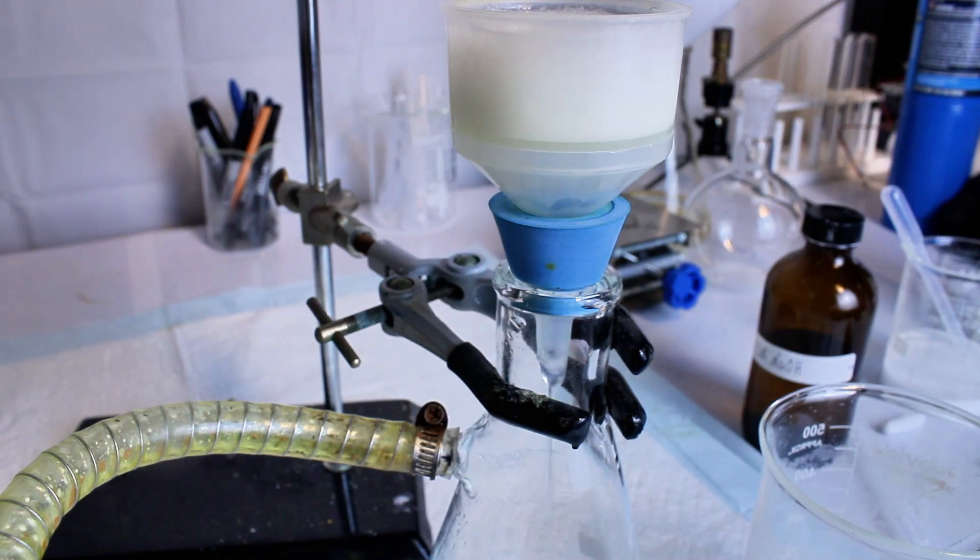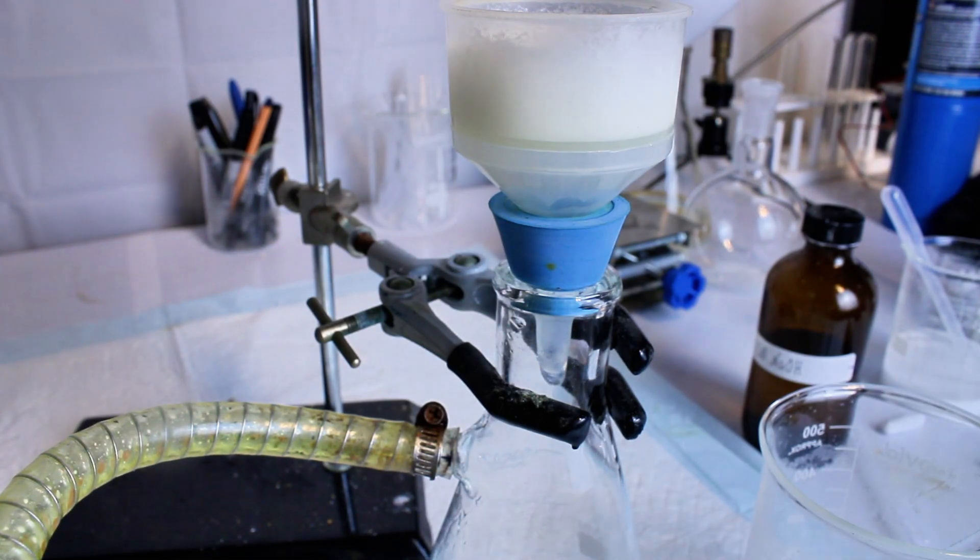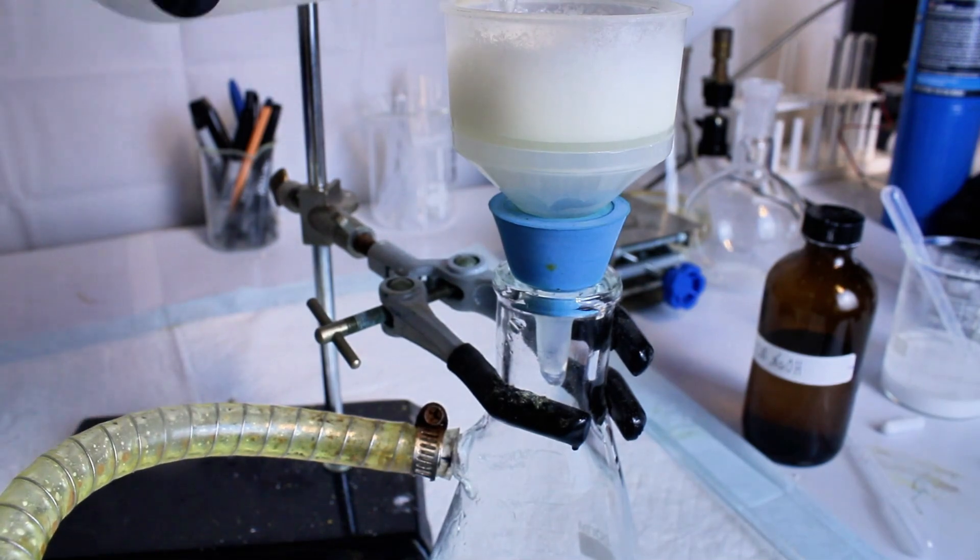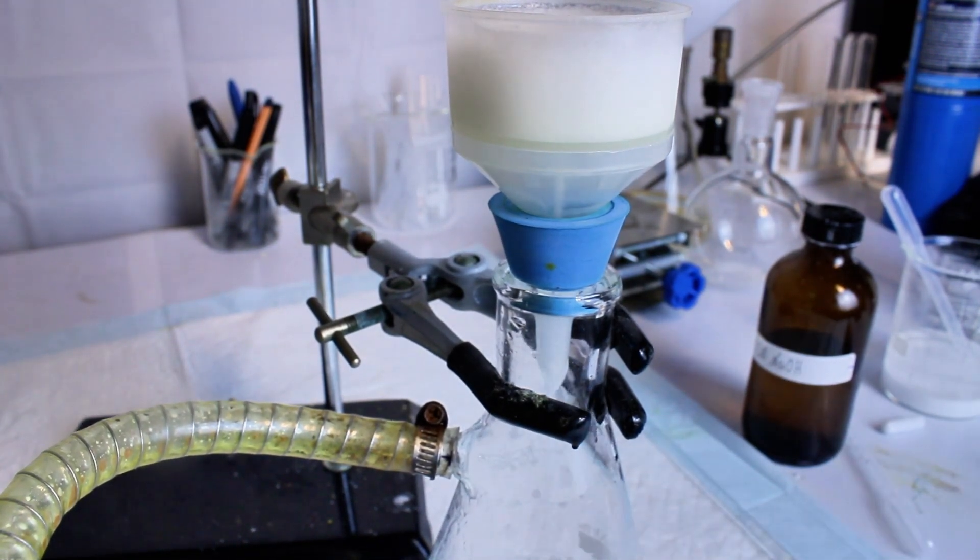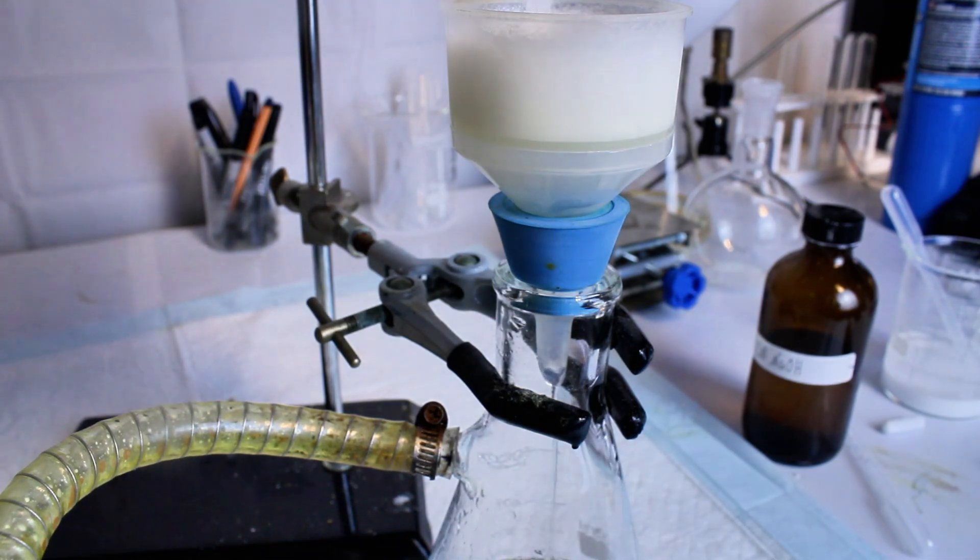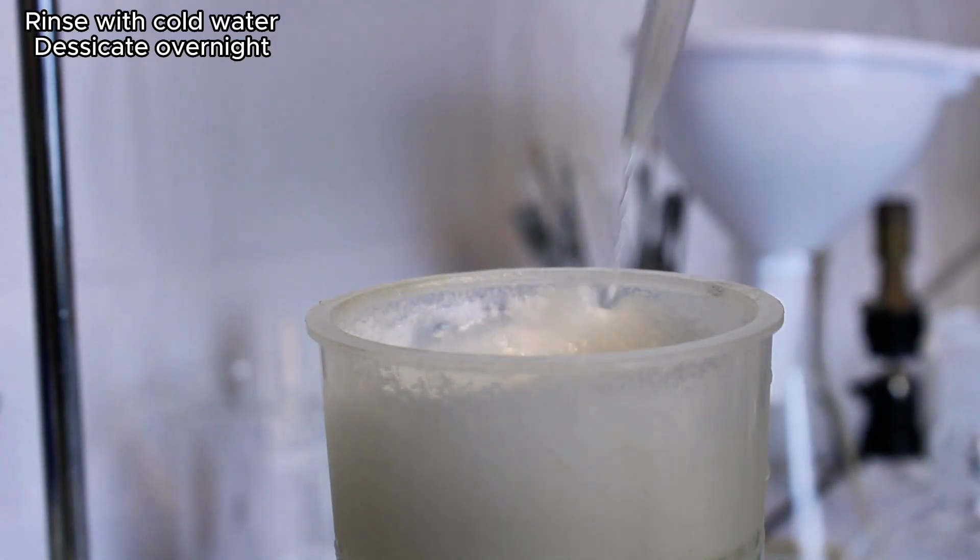I then transfer my product to a drying dish and let it dry overnight in a vacuum desiccator. This leaves me with a final mass of benzocaine of 5.96 grams, which represents a 69% yield, which is okay, but I think it could have been better.